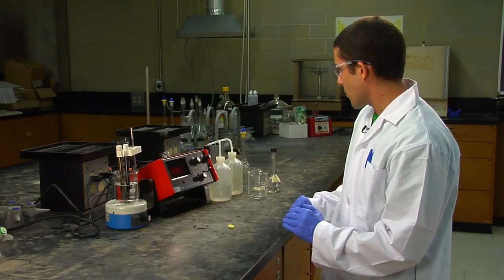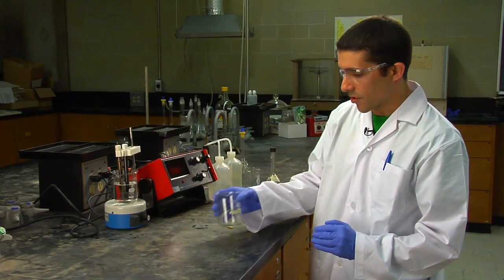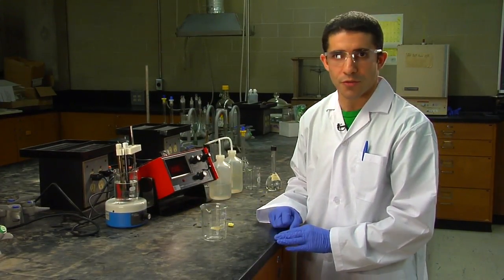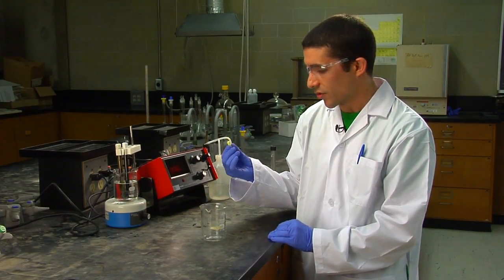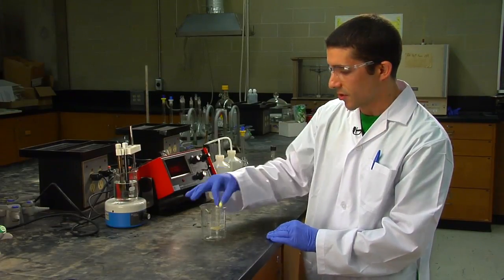To prepare to do a measurement, you would just simply take a beaker, best to use a 250 ml beaker. You're going to place in that beaker your magnetic stirrer to allow mixing to occur during the potential measurement.